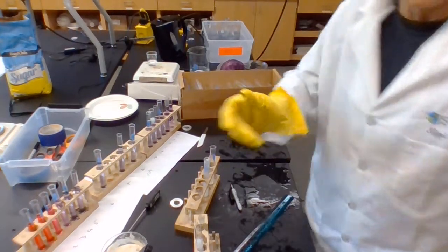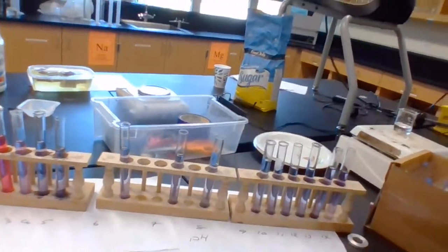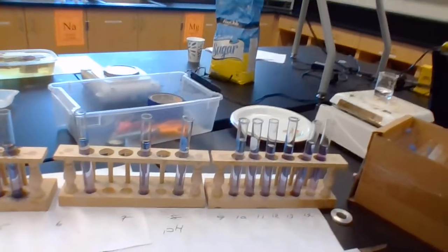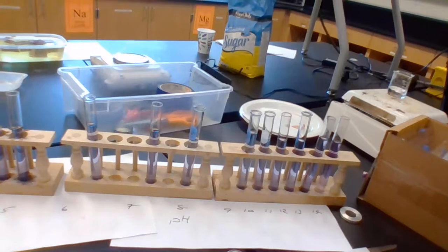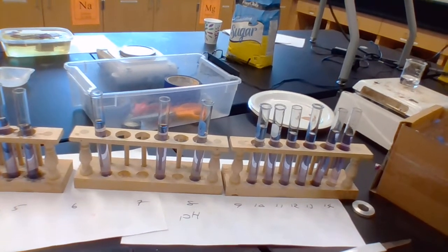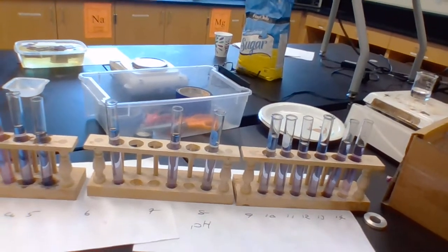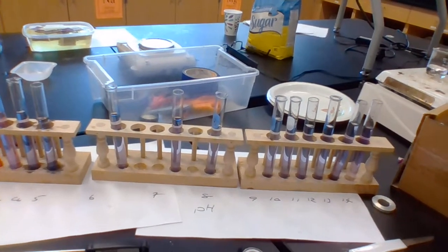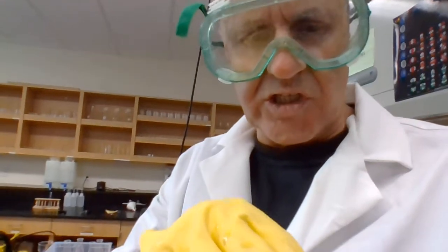The next thing we're going to do is, let's just bring this down for a minute, we're going to have a look at the same things that I did before with the pH scale. I've just used serial dilution to make my range of pHs, and I've used a very quick cabbage indicator to show the pHs, and I've got the full range from 0 to 14. When I come back to this, I will put those together and we'll look at the effect of pH on the rate of an enzyme-controlled reaction.